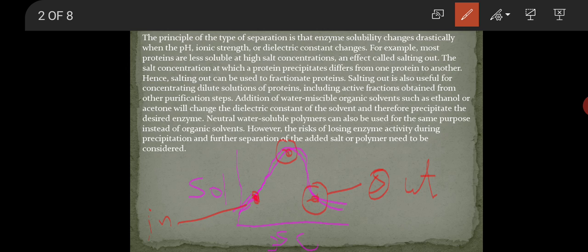So what we studied theoretically, I am telling through this graph. At low salt concentration, salting in; at high concentration, salting out, and it creates the mass-like structure that we have already studied. So that is all about salting in and salting out.